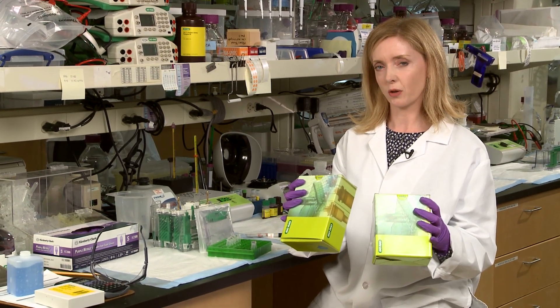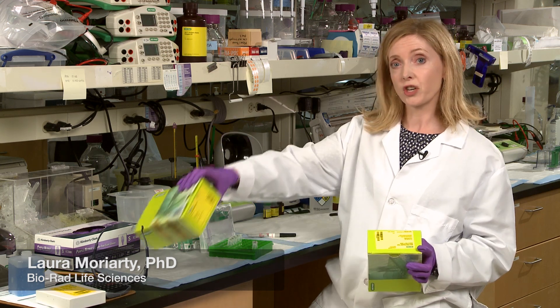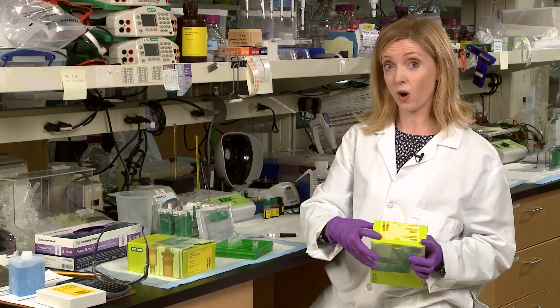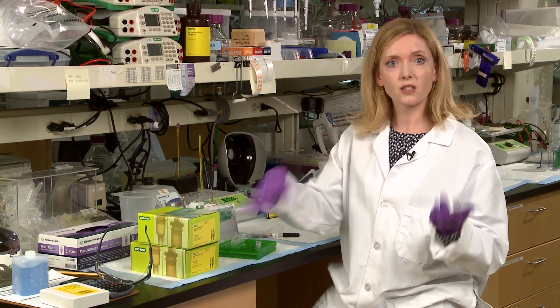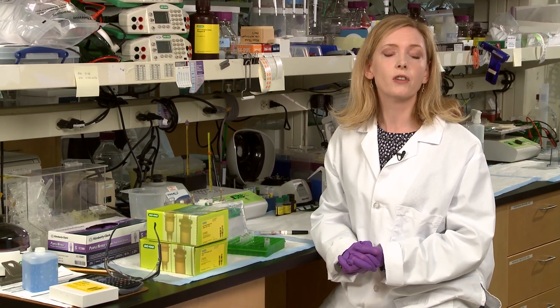Are you stumped by what percentage gel to use? Do you go gradient or 8 or 12 percent? Are you a creature of habit and always use the same one? Whether you're using precast or handcast, here are four tips to make it easy to pick the perfect gel for your experiment.